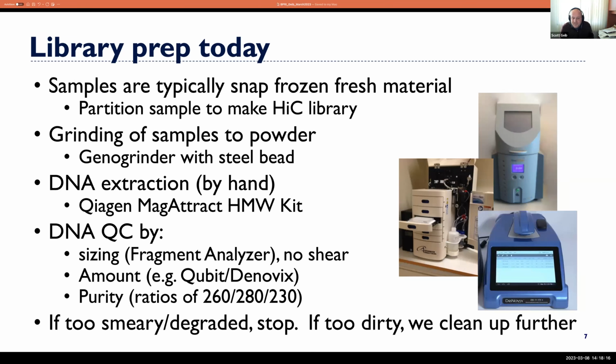So yeah. So if it's too degraded, smear, stop. If it's too dirty, there's a lot of ways you can clean the DNA up further from just the high molecular weight extraction kit. One thing I'll just say, yeah, go ahead.